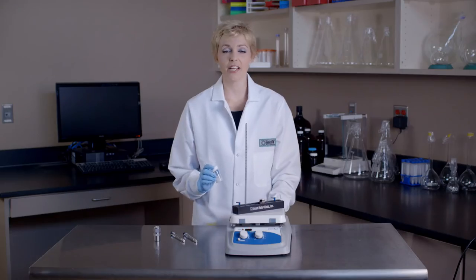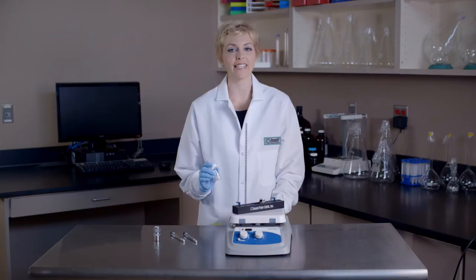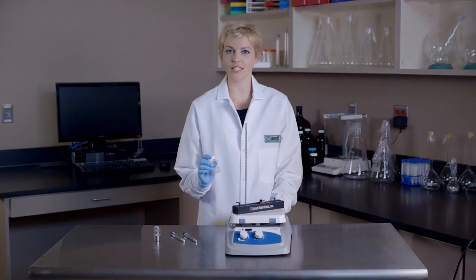Next, we will hydrate our dry lipid mixture using a suitable buffer for at least 30 minutes. Always remember, the lipid suspension should be kept above the phase transition temperature of the lipid during both hydration and extrusion.